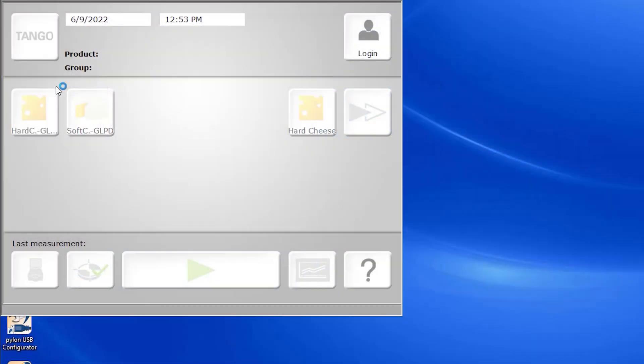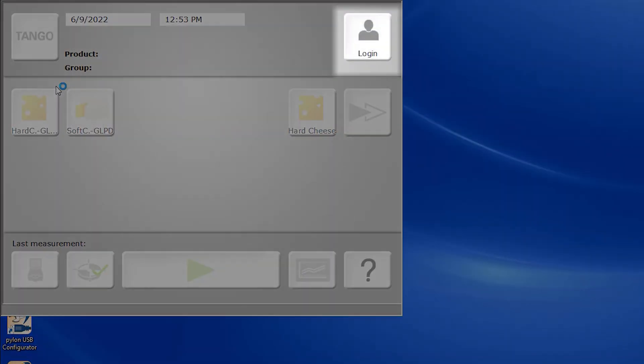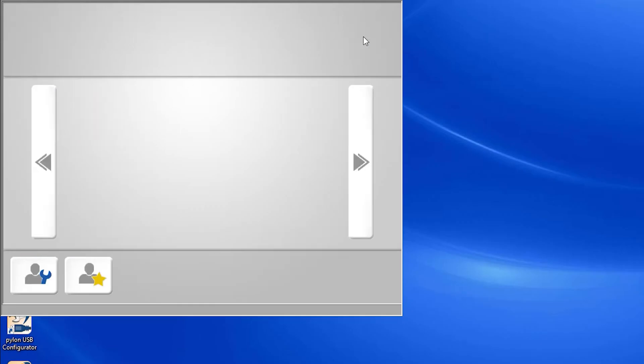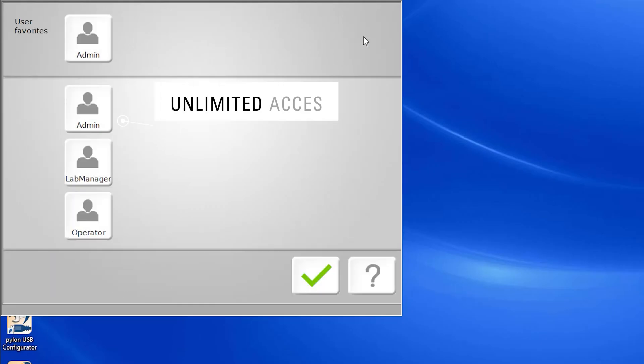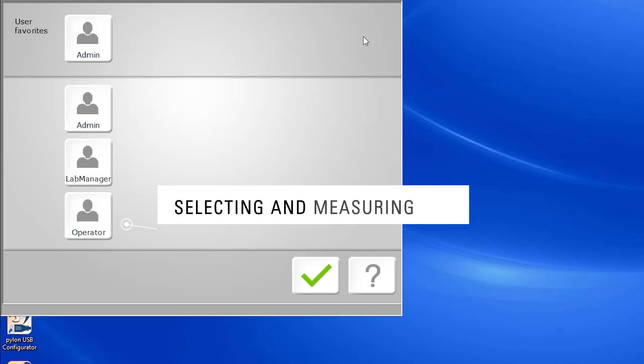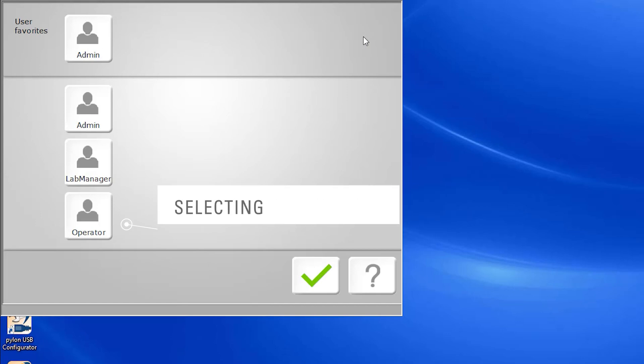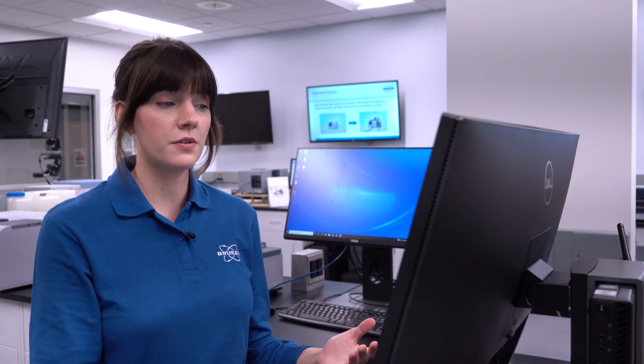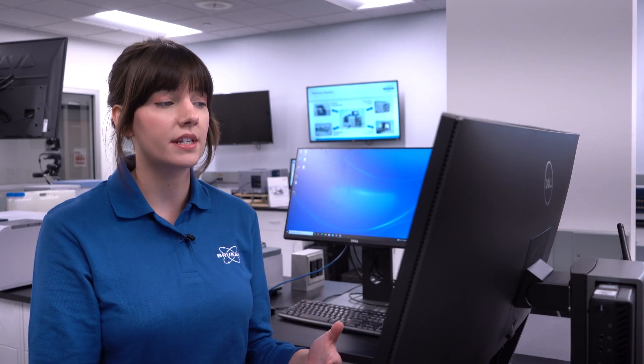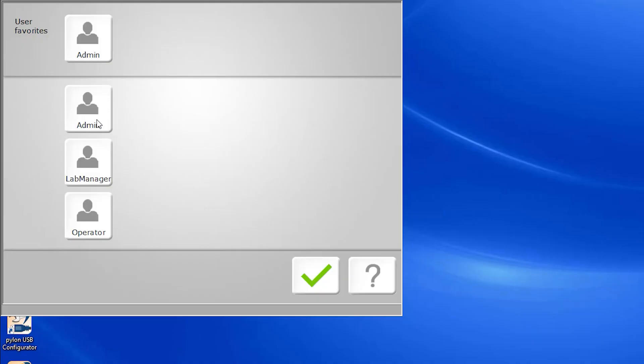Once you launch the Tango GUI, the only option you have is to log in. There are three main user options that come with the Tango. You can log in as an administrator, which has unlimited access to all the global and program settings, lab manager, which has comparatively limited access, or as an operator, which has standard access that is limited to selecting and measuring products. We typically recommend running the Tango GUI as an operator so that program settings aren't accidentally altered.